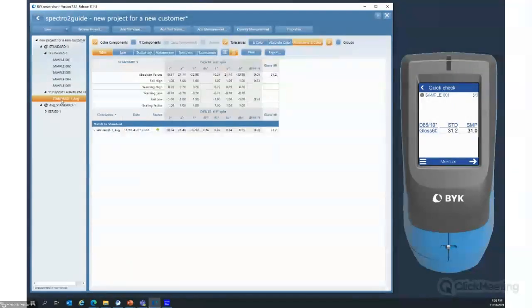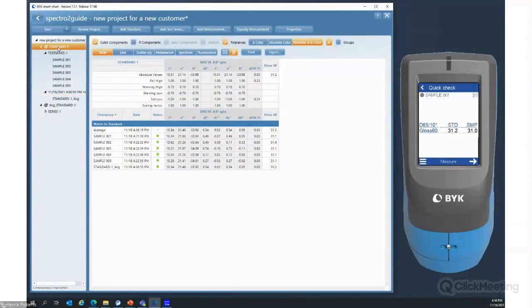So, then you get this one here, and these are the same numbers then in this row here. Okay.